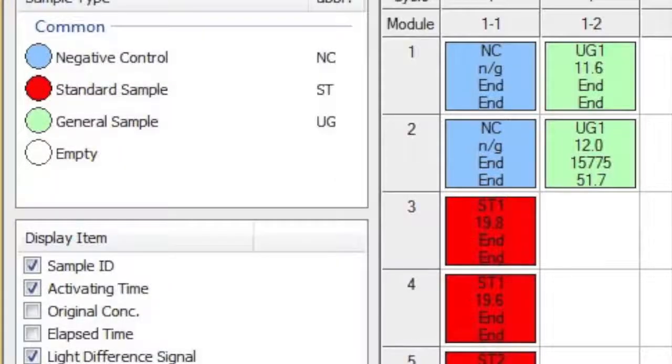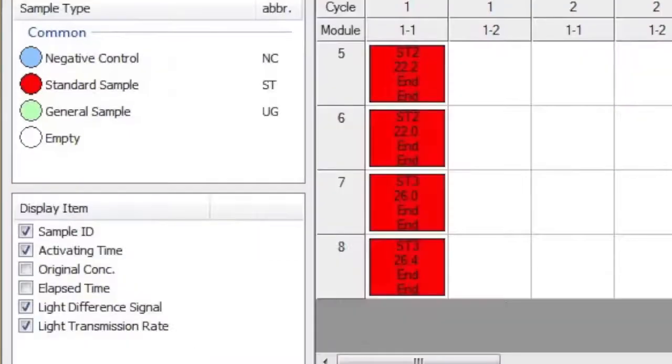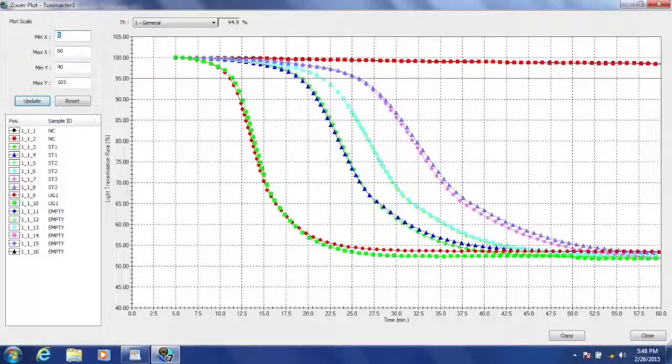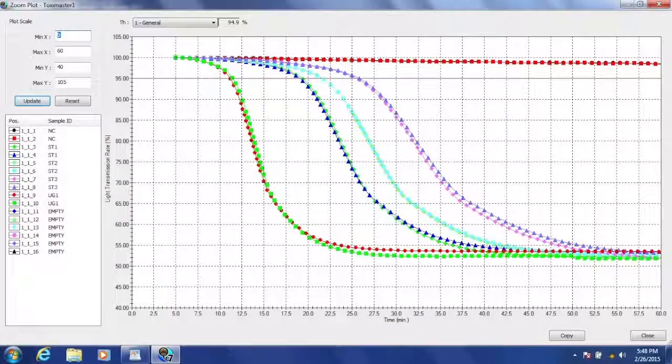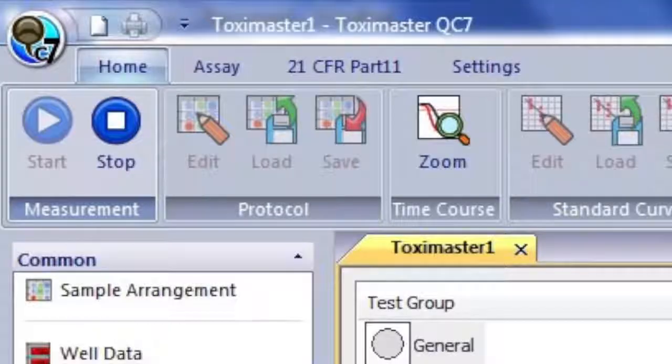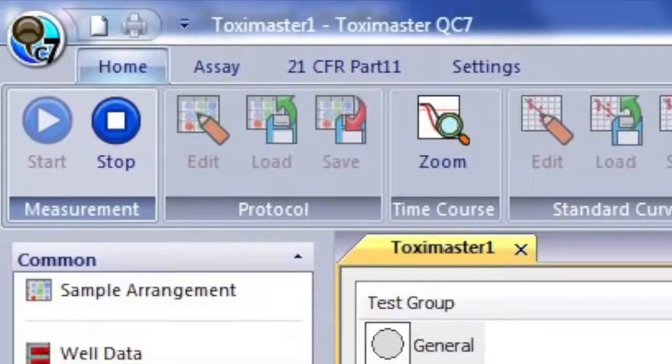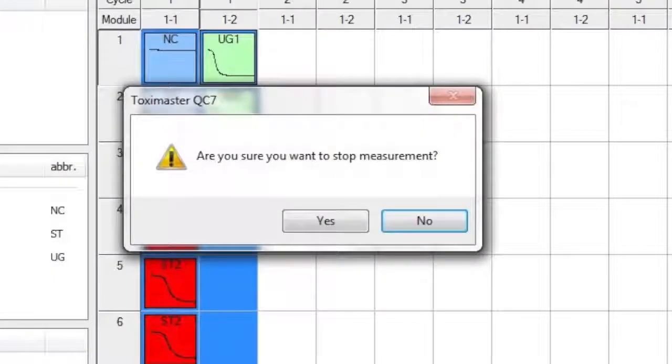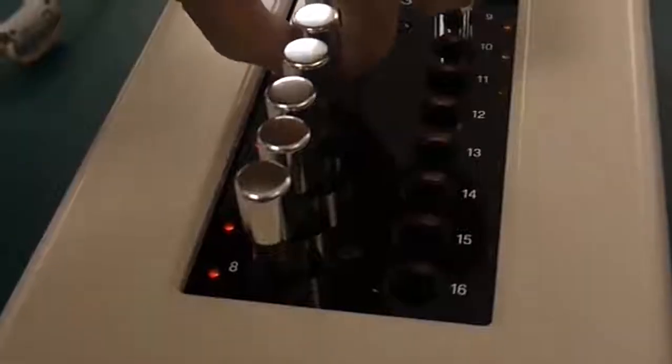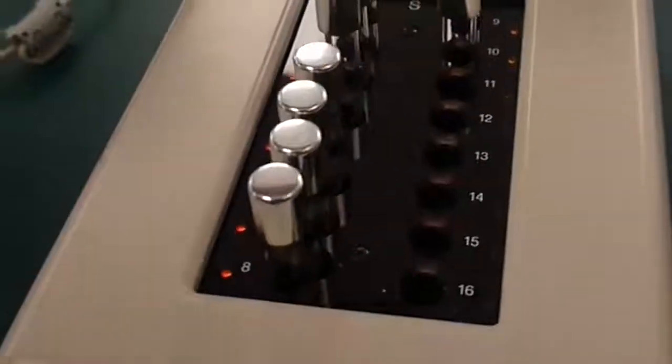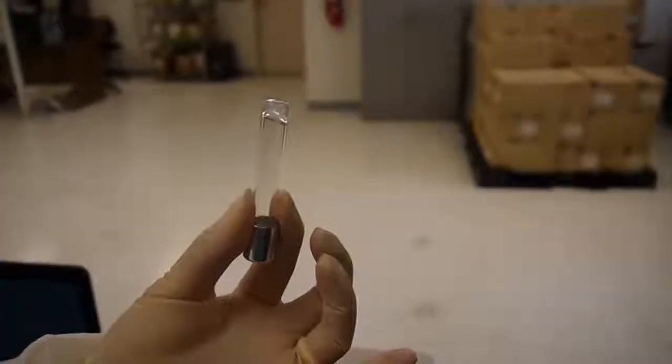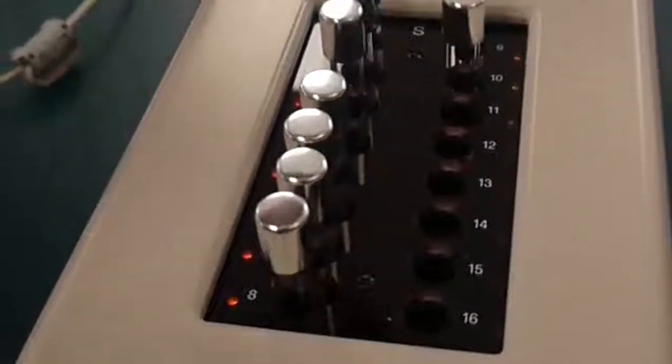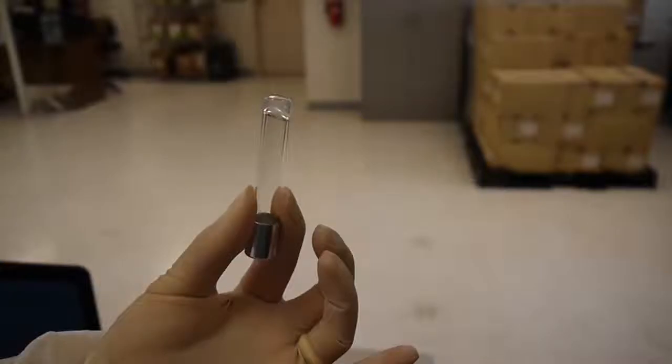As our samples reach the end of the timed cycle, we notice the data appearing within the sample boxes. We also notice that each sample has reached the end of the zoom plot. We must now select the Stop Measurement option to complete the testing cycle. You will also be requested your account name for logging the results of your test. Now that the testing cycle is complete, we can check the gel clot results of each sample.